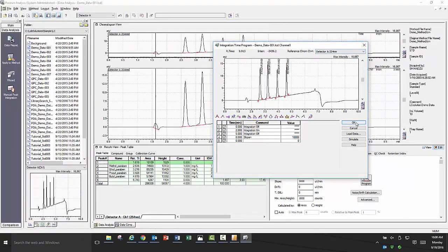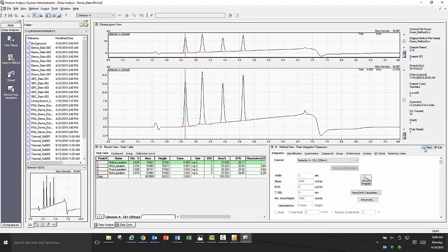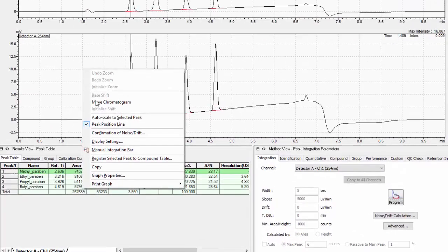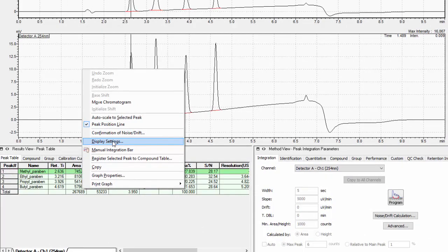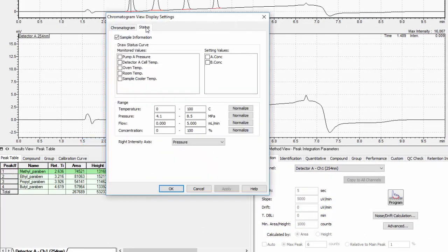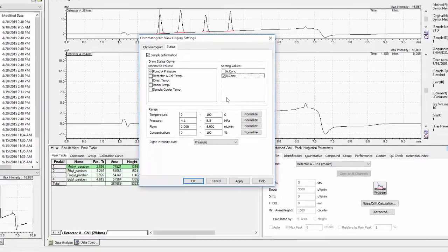Within each data file, there is additional data that you can overlay in data analysis. We refer to these as traces and in order for them to be displayed, right click in the chromatogram and select display settings. Once the window has opened, click on the status tab and then you can select which trace or traces you would like to view and on what scale.